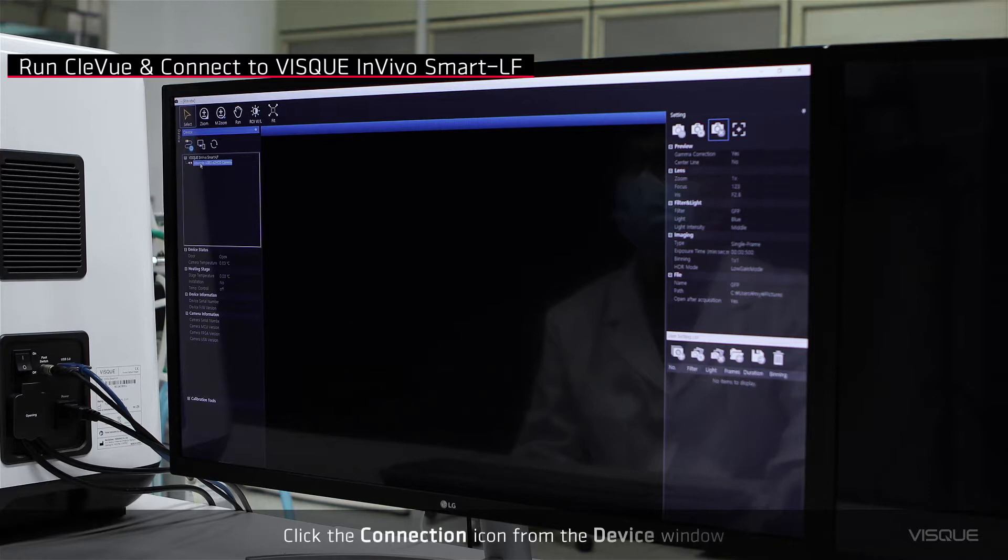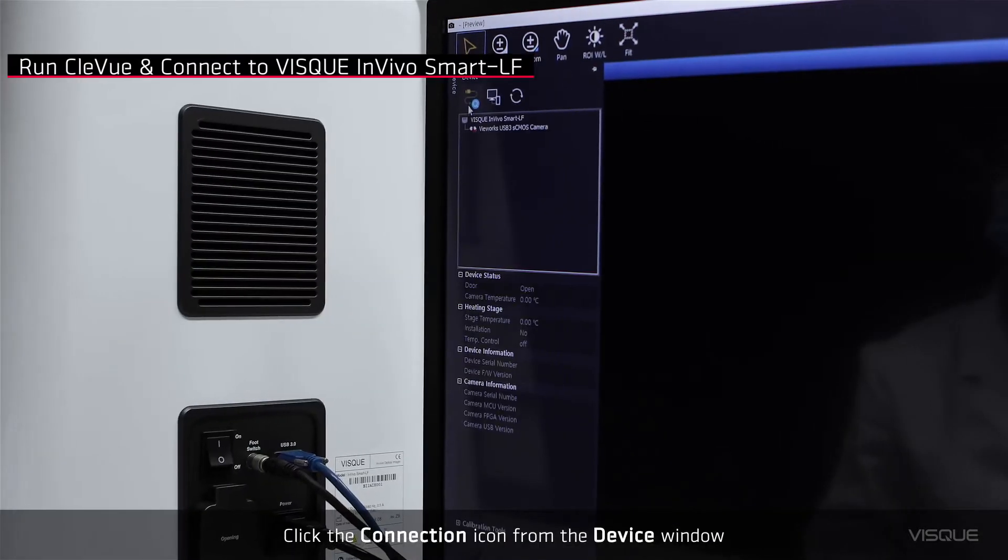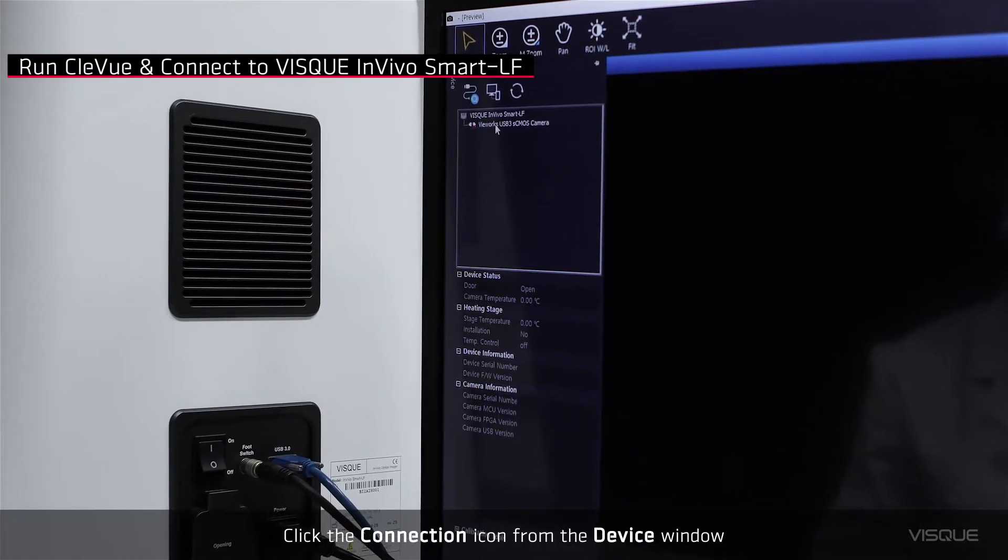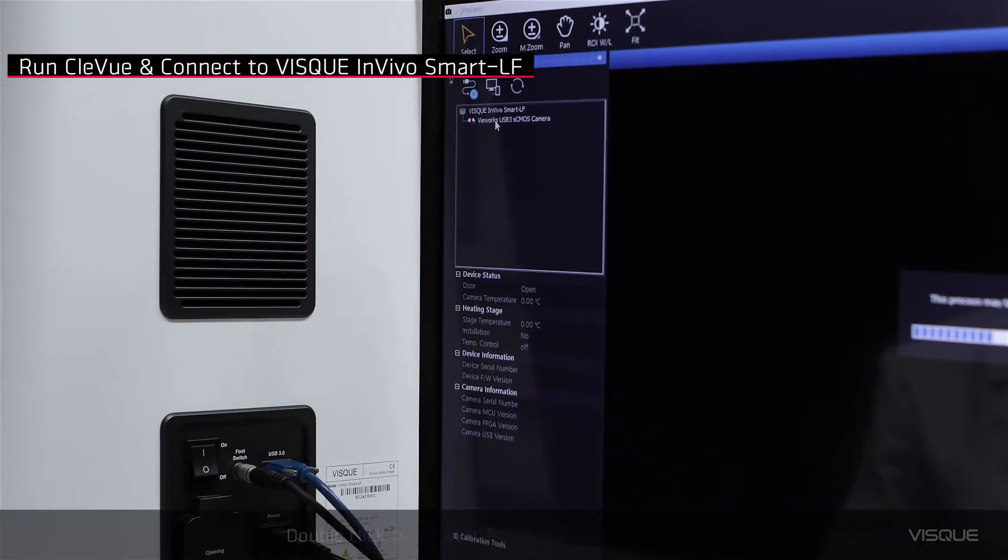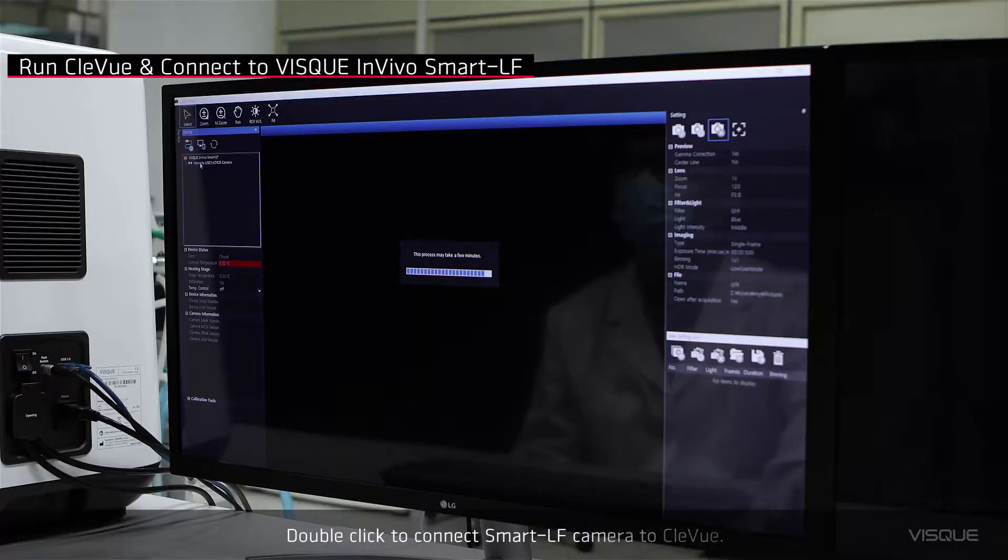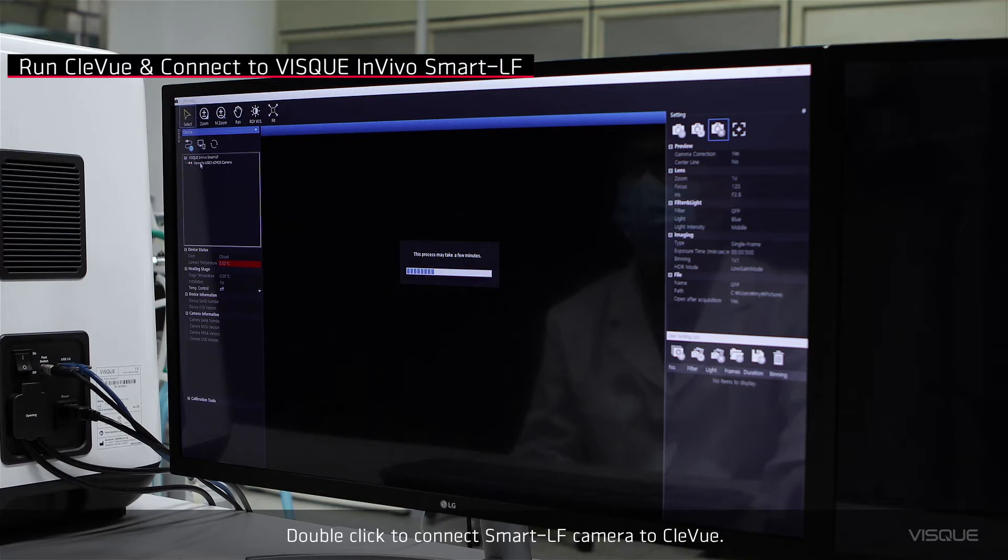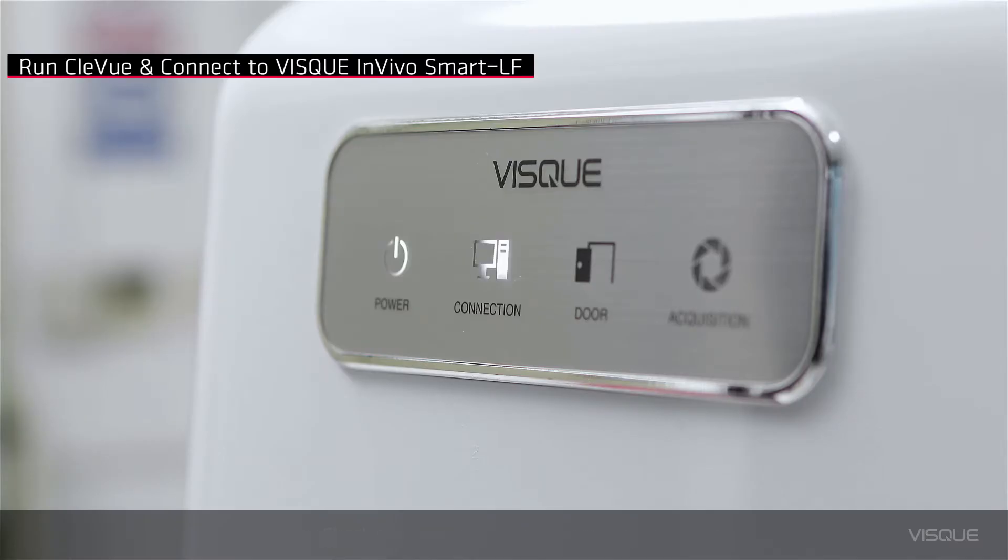Click the connection icon from the device window. Double-click to connect Smart LF camera to CleView. Check the connection button from the device.